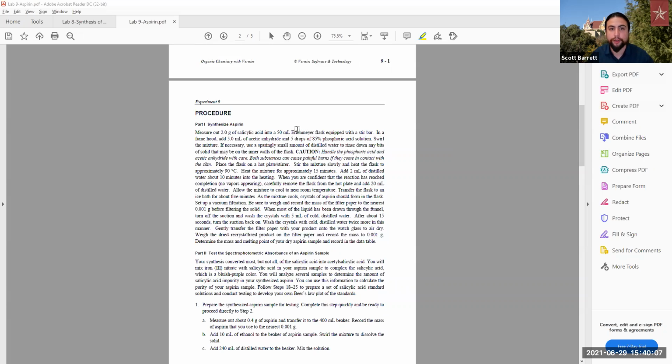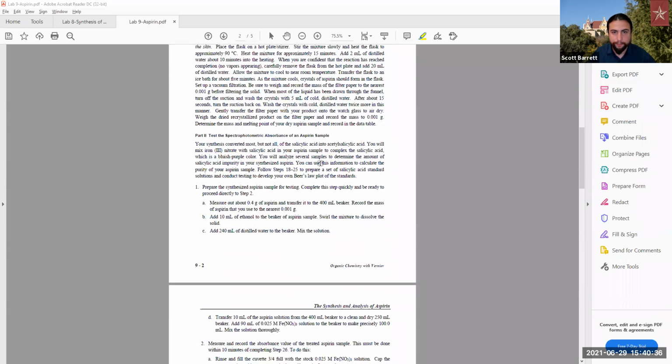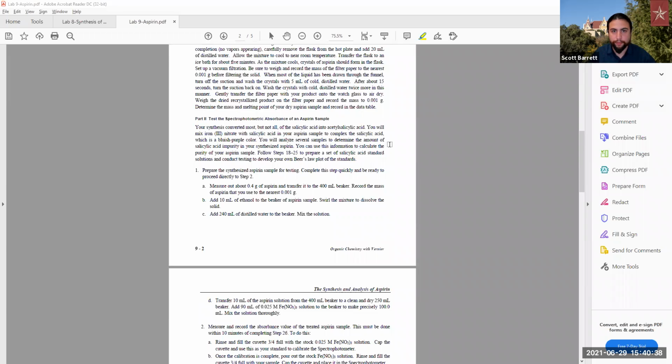Then down here, you have your glassware, and it's also listed throughout the video, so I recommend everyone watch through the full video if you need to get out every single item. Another machine here would be this hot plate stirrer. And then going down, let me check to see if there are any other additional machines you need to worry about. Make sure to list out all glassware for vacuum filtration, including the sizes there. And then, let me check here for one moment.